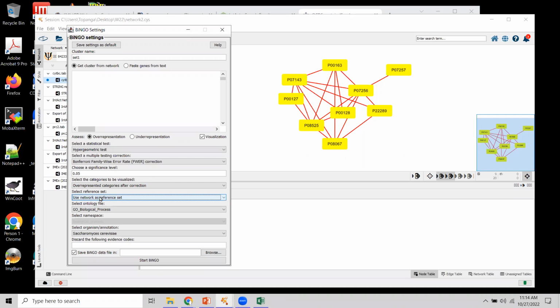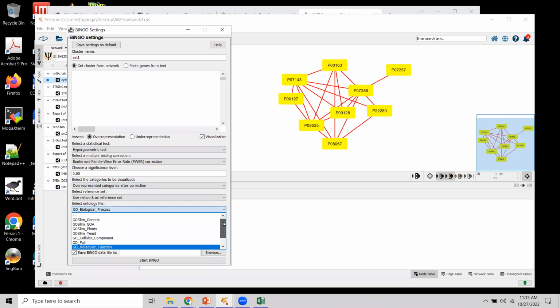And then you're looking at the change in conditions where it can only affect the set you're starting with, not the entire genome. So this is a correction for cell line or tissue type or whatever. This is something you can do here, but you cannot do in STRING. And if this is not done, then you can get funny things happening here. And then we do have a choice of different sets of annotation terms.